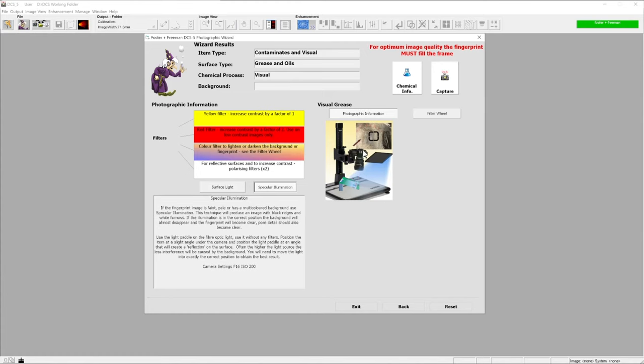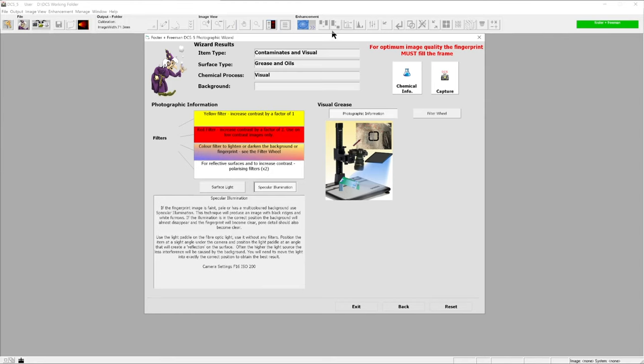Just to the right of that, we have specular illumination. This gives us a rough diagram and a guideline of how we might set that up, as well as a description of how we could set that up ready for photography.